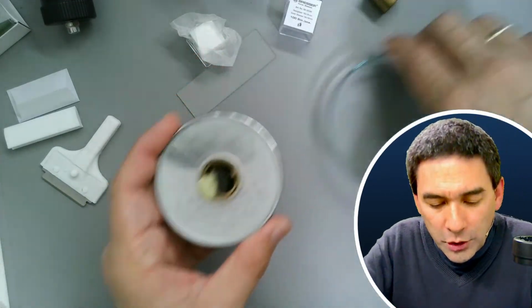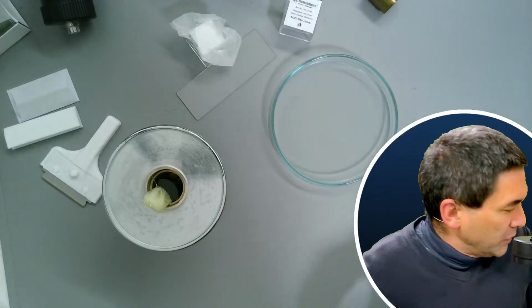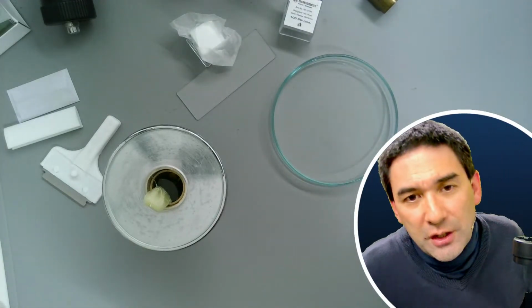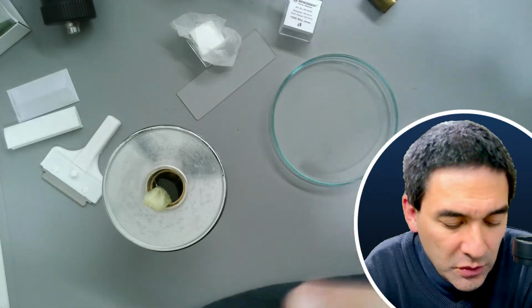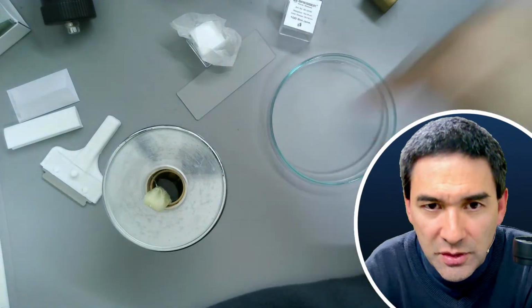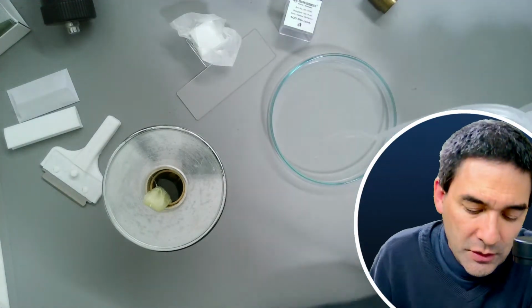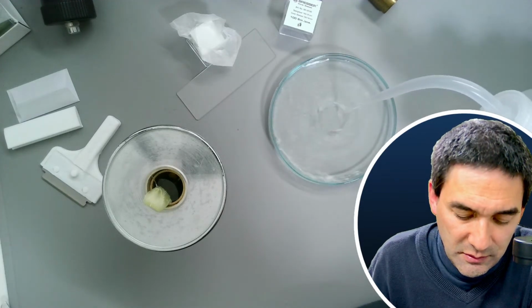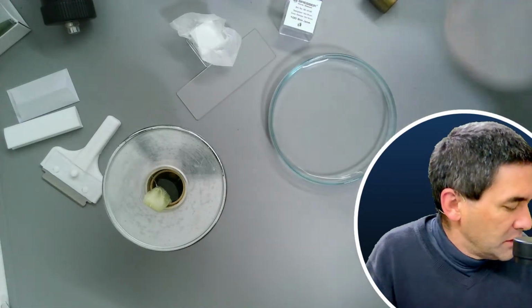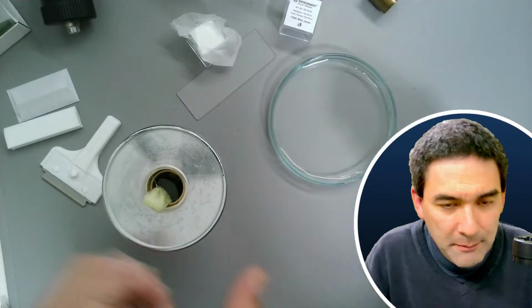The next thing that I need to do is prepare a little dish with water. Let me put all of the other vegetables away for right now, because the cross sections are so thin that they dry out relatively quickly. So I want to immediately place it into some water. Because I don't have any running water where I am right now, I just use this here. Tweezers are also always useful to pick up the sample.